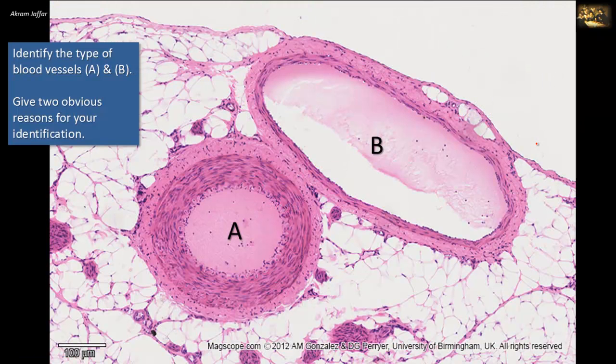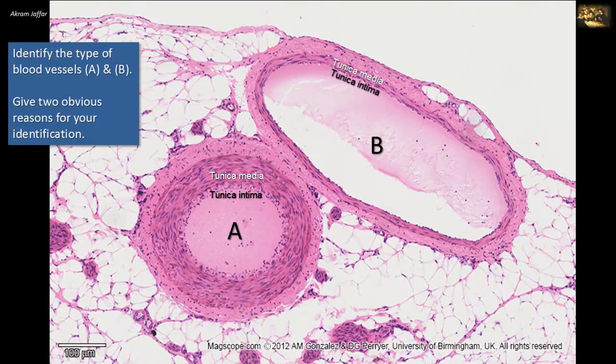Identify the type of blood vessels A and B. Give two obvious reasons for your identification. Both blood vessels show the three layers of tunica intima, media, and adventitia.